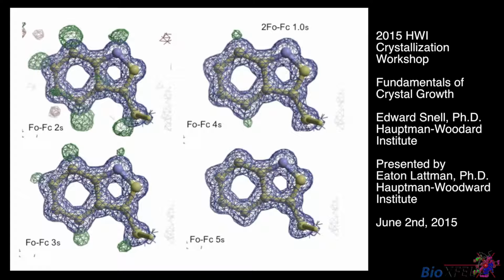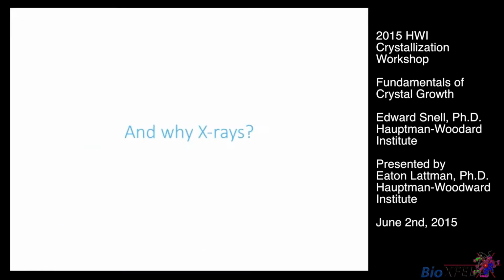These are illustrations of difference maps. First of all, you can see how accurate the structure of these rings are, and you can really see the holes and everything. But difference maps, where this is a sigma, I presume, give you a view of weak density in the difference map, and reveal hydrogens very clearly. So these crystals can really tell you a lot, especially when they diffract to extremely high resolution. This is a very favorable case.